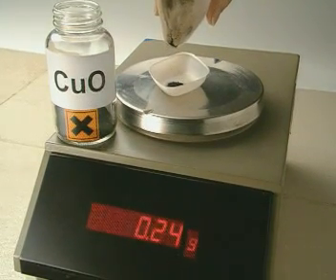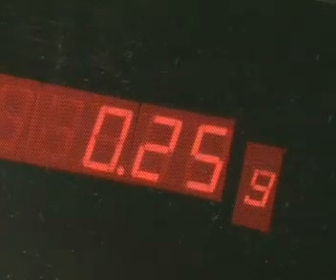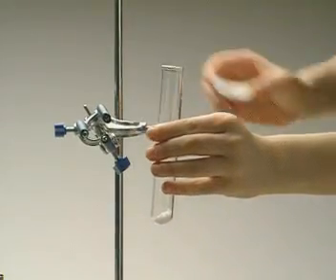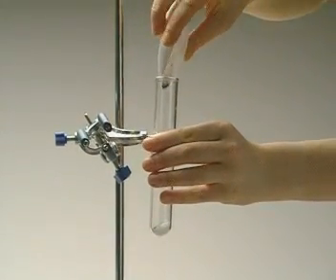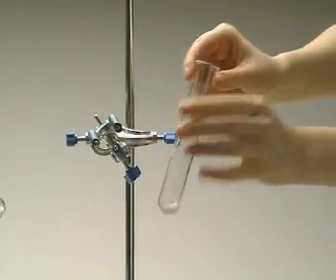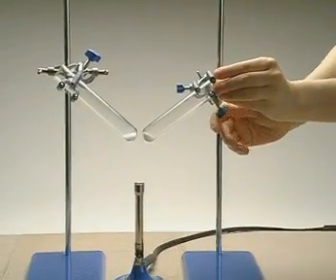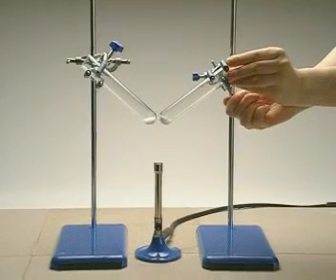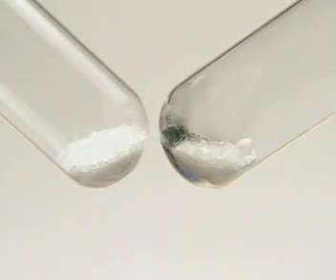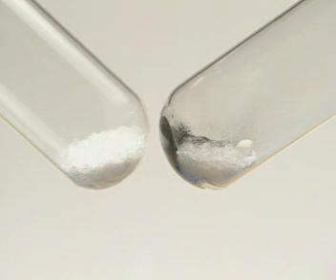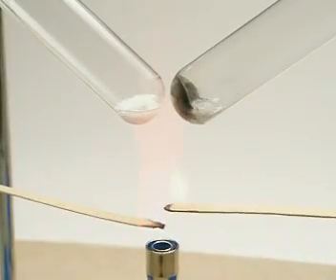For this next reaction, we'll be using 0.25 grams of copper oxide. It acts as a catalyst in the thermal decomposition of potassium chlorate. The tube on the right contains the catalyst; the one on the left doesn't. As the potassium chlorate is heated, it decomposes and gives off oxygen.